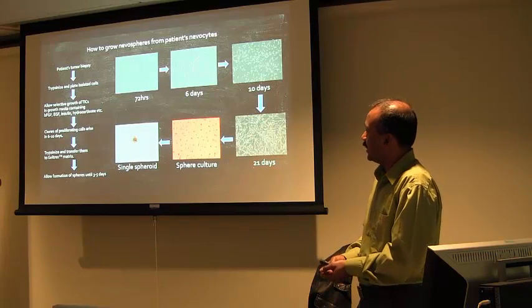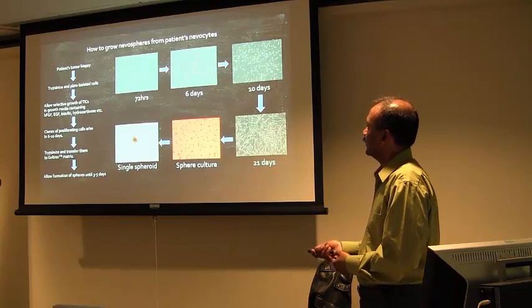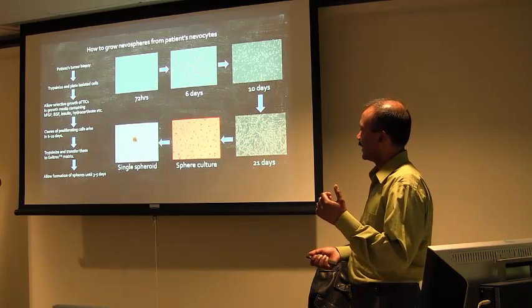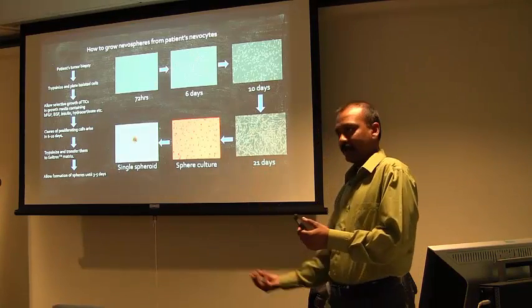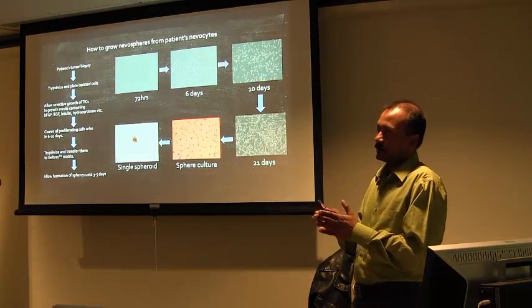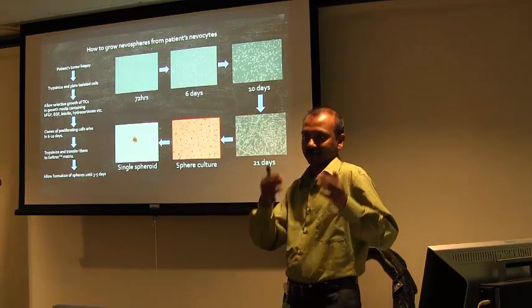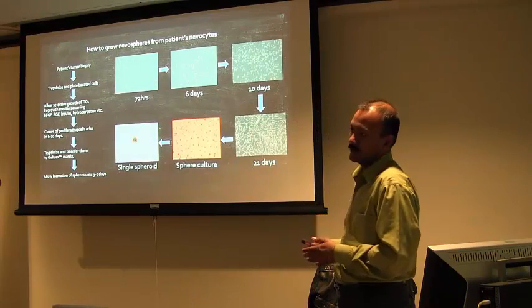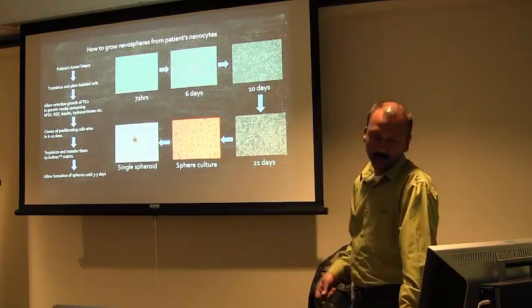But if you want to do a Western blot, and you want to harvest the cells, you have to get rid of the matrix first. So you solubilize the matrix in PBS, EDTA or something like that, pellet down the cells, then lyse the cells. You cannot really get an exact count of cells in every sample. You have an equal number, but what we normally do is estimate the protein content and normalize with that. It works very well.